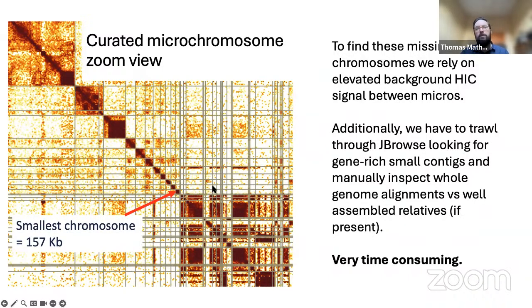And it's important to stress that in a lot of these assemblies, we do find contigs or scaffolds that stand out on their own and look like individual chromosomes, but it's quite likely that they represent fragments of an assembly rather than the full length of the chromosome. Often this is the best we can do with the data we've got. So likely some of these repeats belong to some of these chromosomes, but they don't map with sufficient uniqueness to be able to join them together.